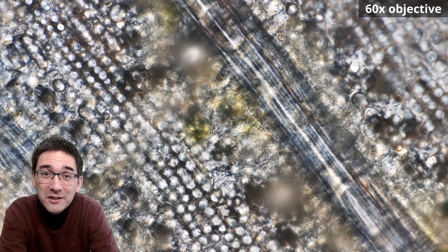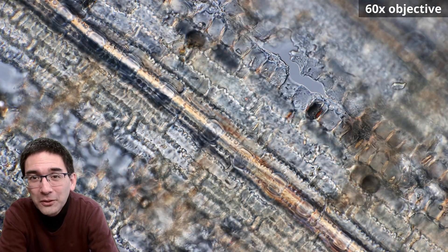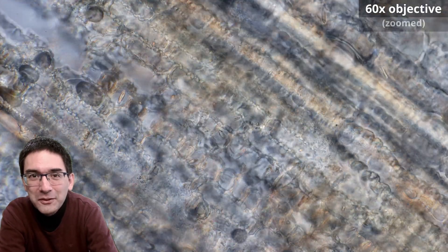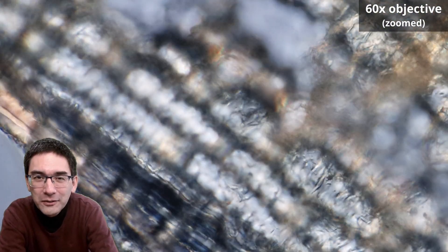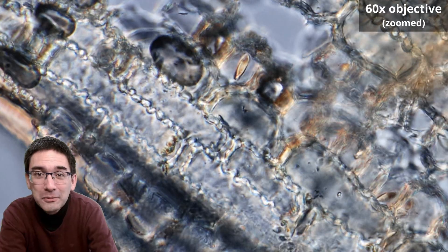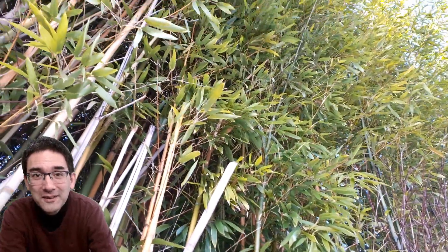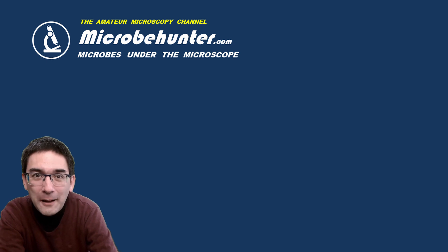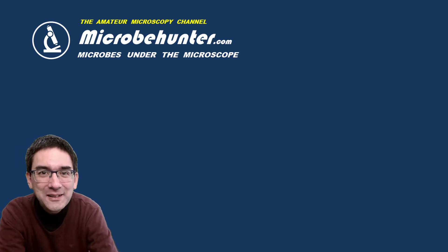As I mentioned, other leaves that are a little bit softer might not work quite as well this way. But I'm happy to share this method with you. Maybe next time I'll find another way of cutting a leaf, perhaps using a microtome, or maybe I'll put some bamboo wood under the microscope — I haven't tried that yet. I hope this video was informative and motivates you to observe bamboo if you have it available, and also suggests a couple of other processing techniques for specimens. Happy microbe hunting as always, and see you around next time. Bye bye.